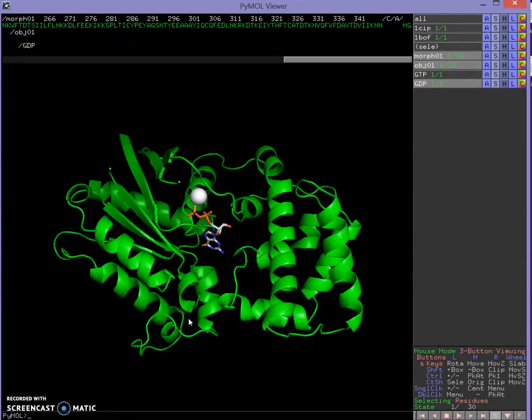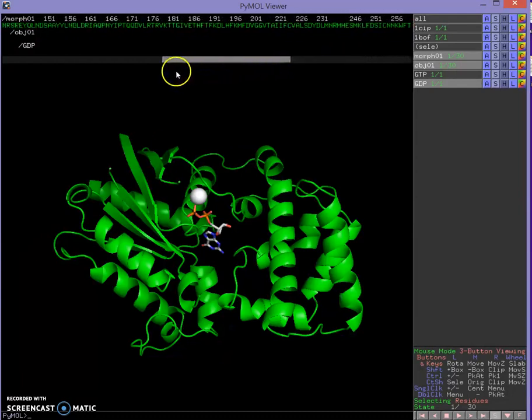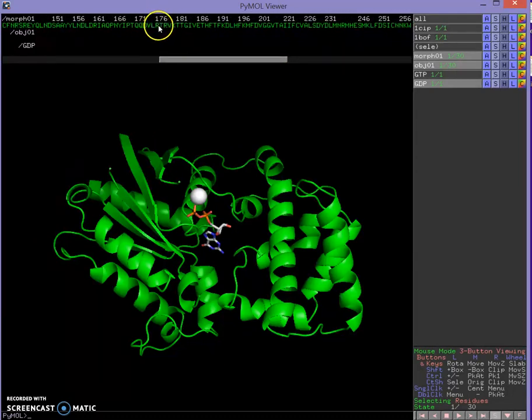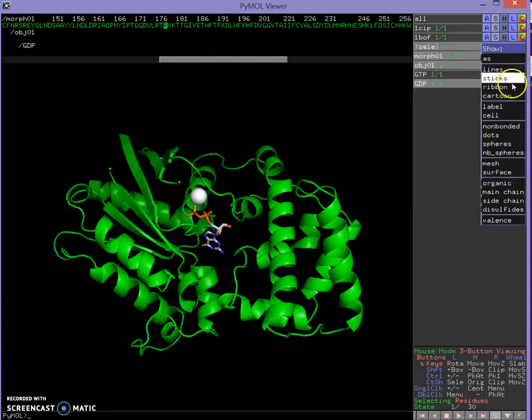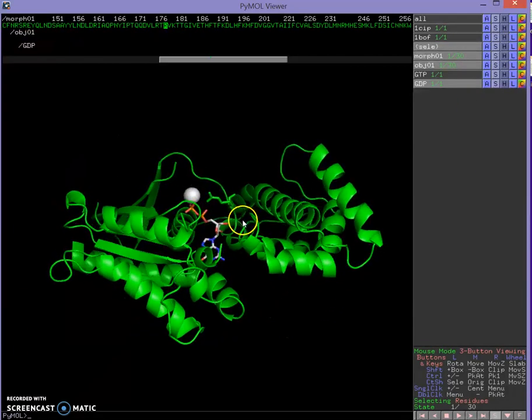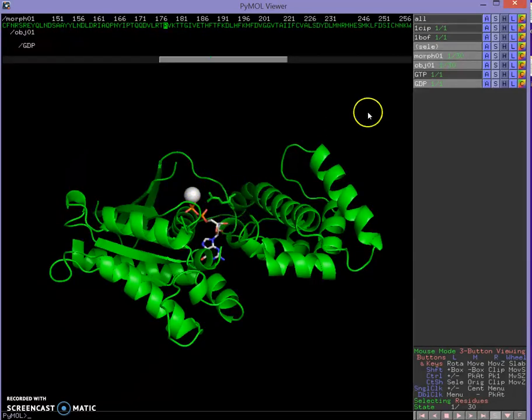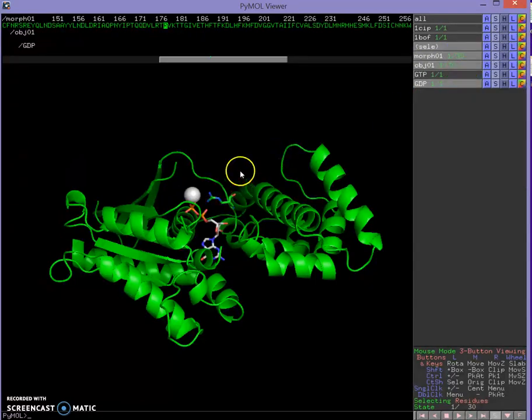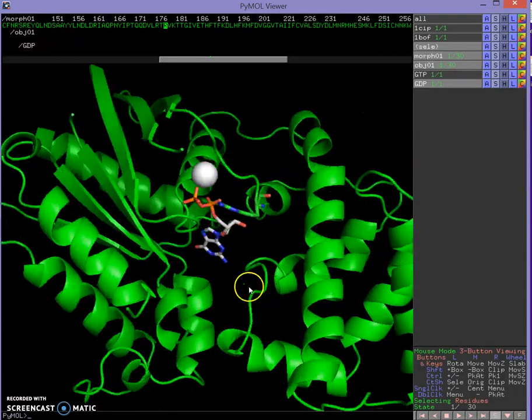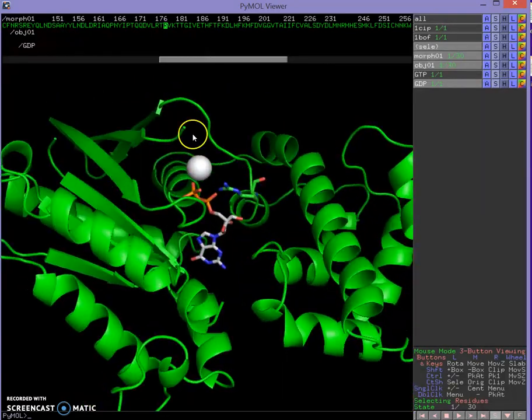Another thing we want to look at is the catalytic residues inside G alpha. One of those is the arginine at position 178. Looking at the sequence viewer, position 178 is this arginine here — that just became my selection. I'm going to show that selection as sticks so it overlays with my cartoon, and color it by element so you can see the side chain.